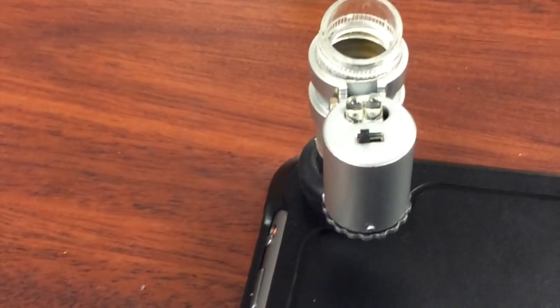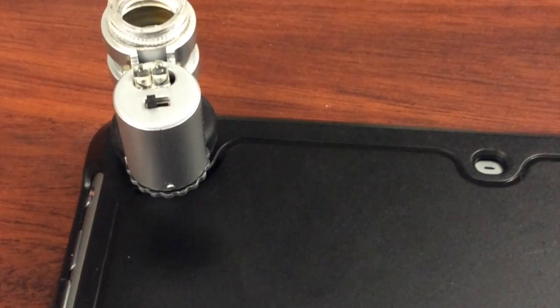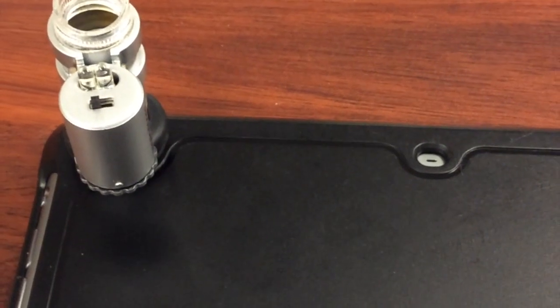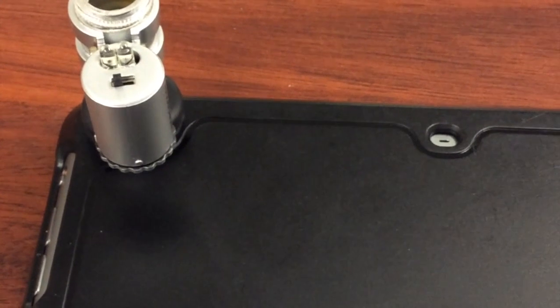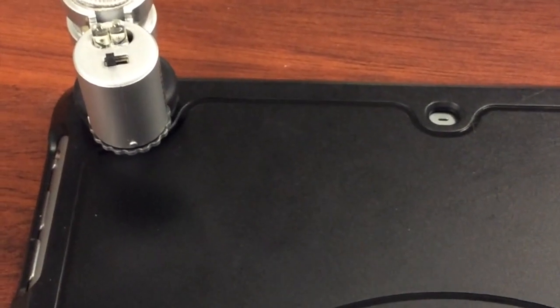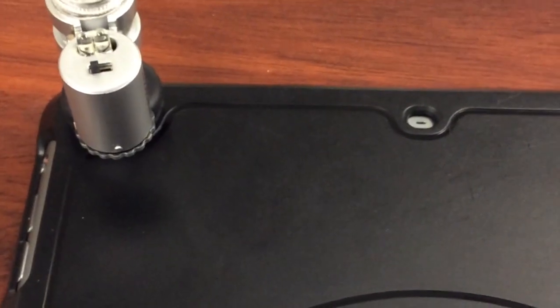Once you have it on there, just turn on your camera on your iPad and you can start to shoot video or pictures. The great beauty of it is that it's literally an under-$5 microscope with 45 times magnification. It's not outstanding, but it's enough for elementary or middle school work, and students can document as video or pictures. From there, they can get into different apps to dub their voice and create presentations, showing their science exploration in ways they couldn't with a regular microscope. Back in the day we had sketches; now we can truly capture high-quality views with photo and video.